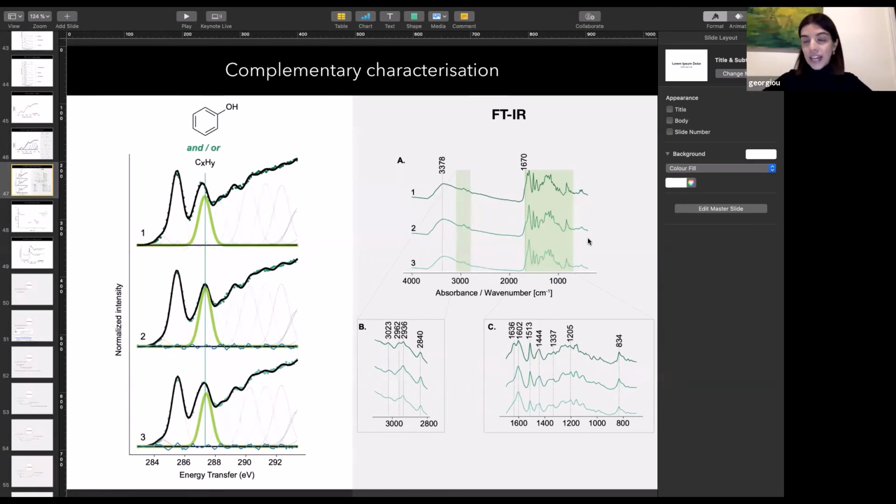I wanted to study bone black, to study the organic phase of bone black, and because you have the hydroxyapatite there, I couldn't detect the carbon signal. I did that with not the optimal instrumentation.